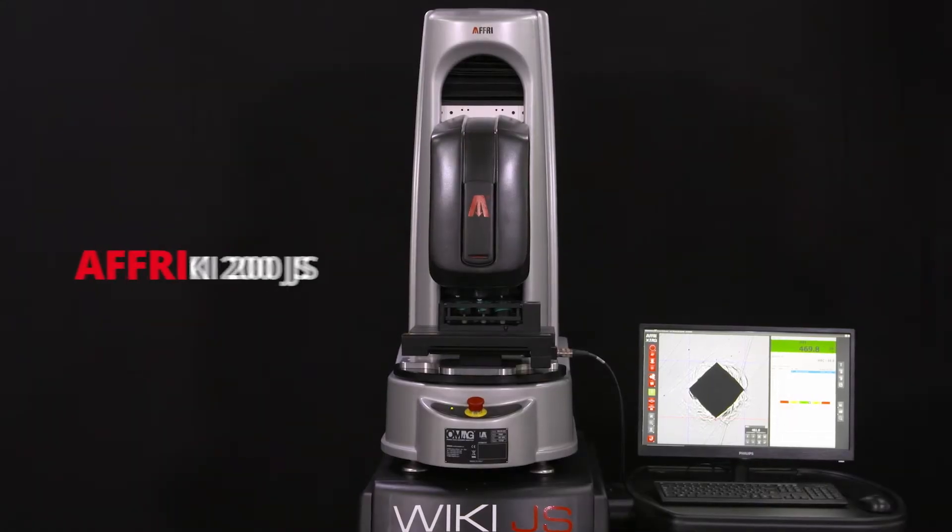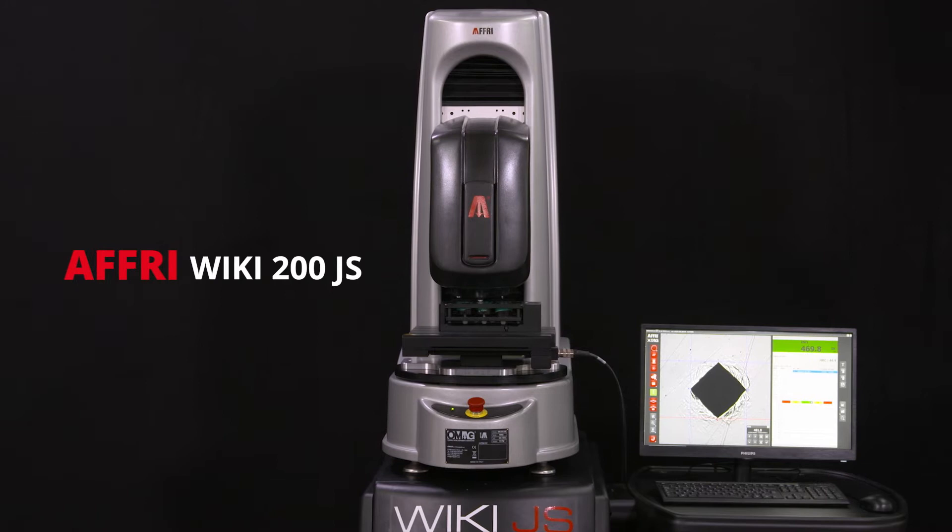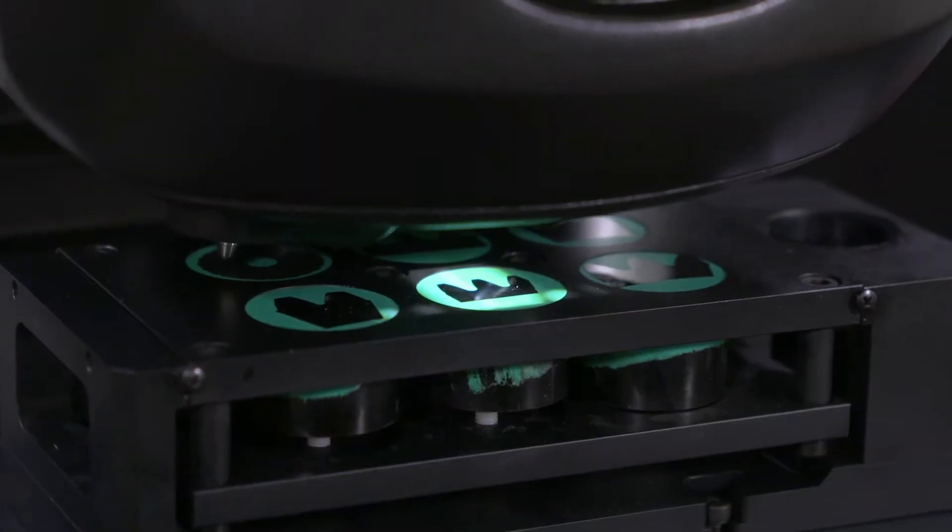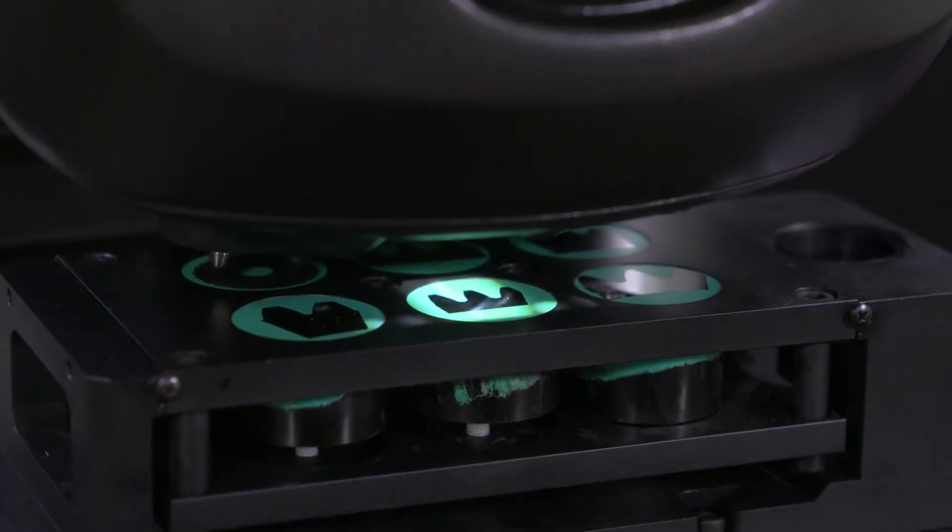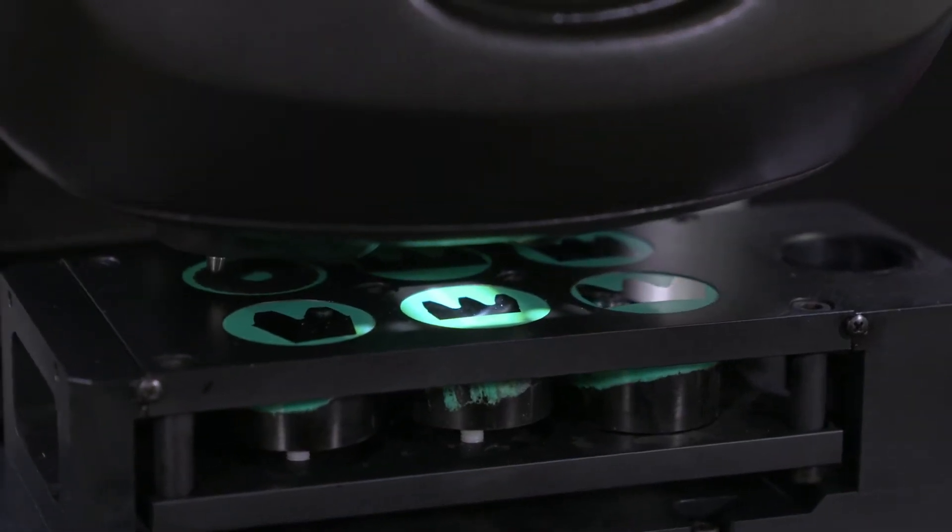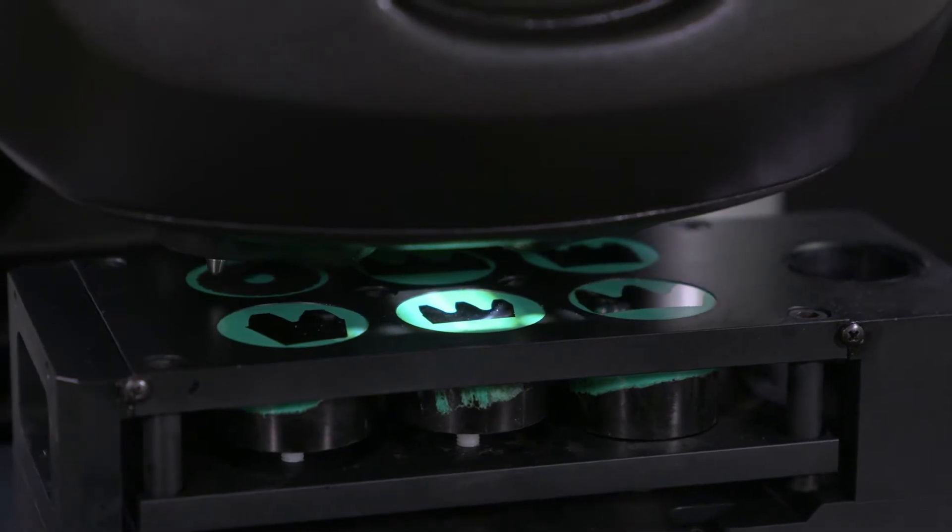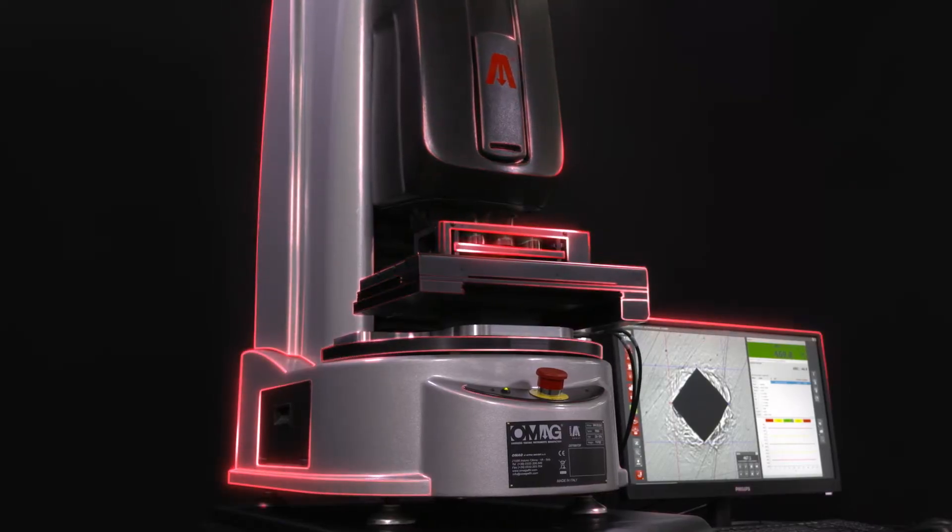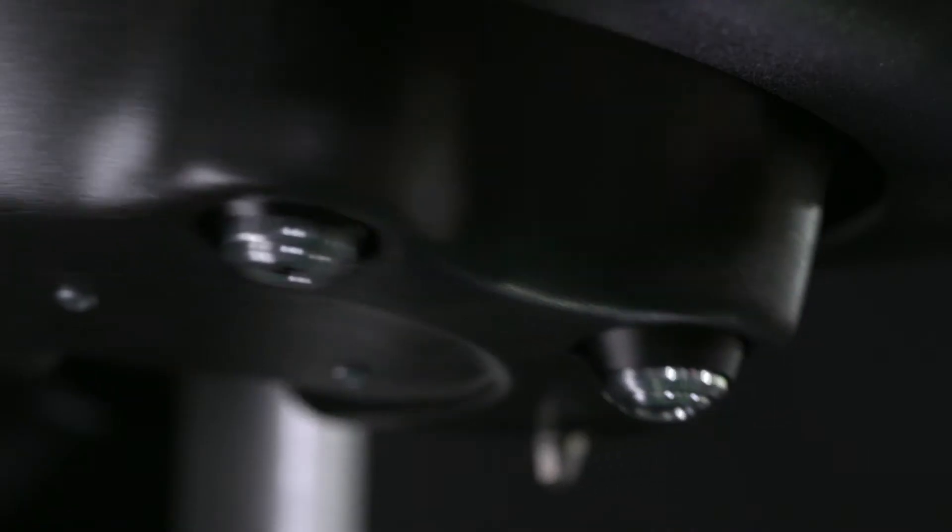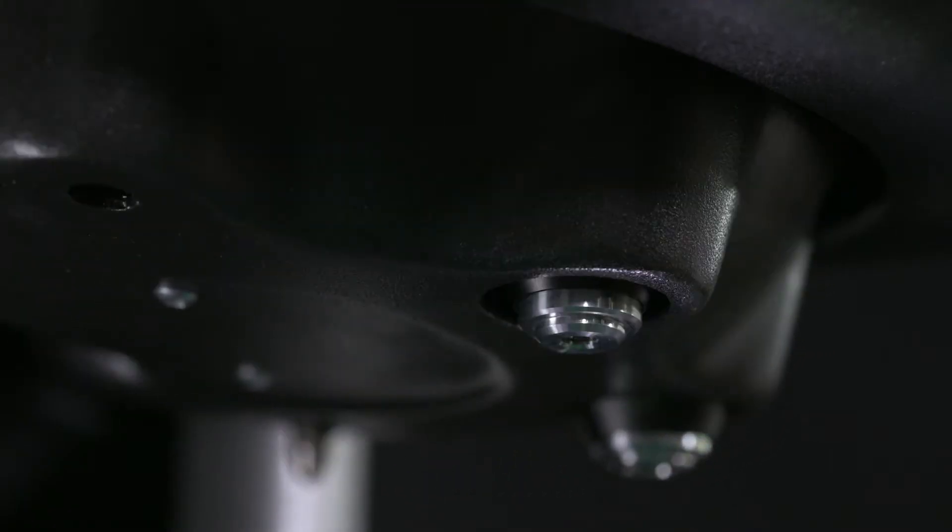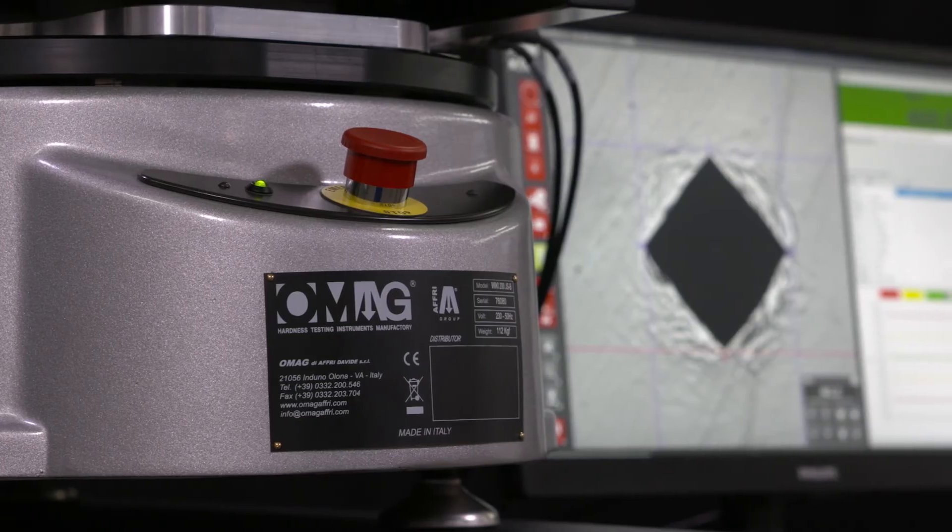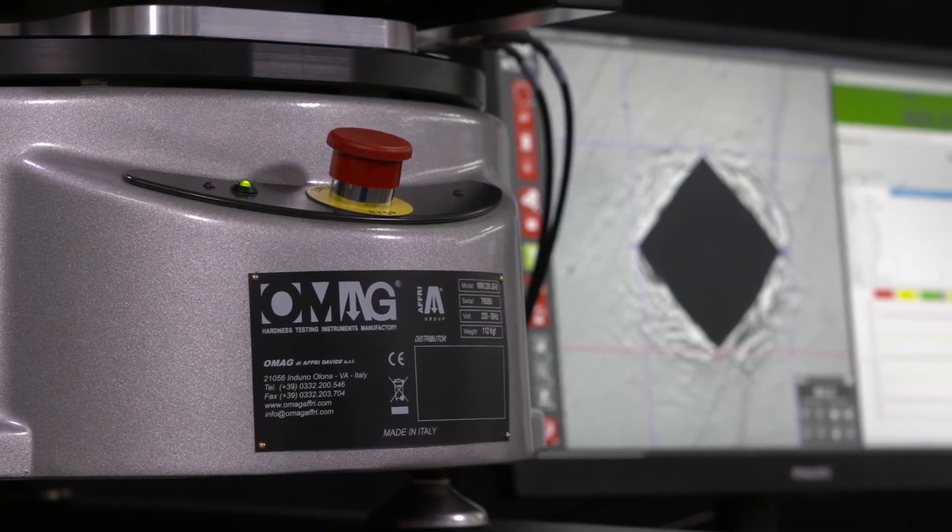The AFRI WIKI 200 JS is a totally automated, extremely accurate system for micro and macro Vickers and Knoop hardness testing in compliance with ASTM and ISO international standards.